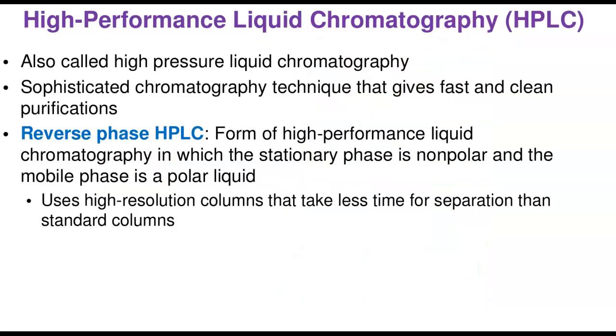So high performance liquid chromatography is also called high pressure liquid chromatography. We have this in our lab. It is the most sophisticated chromatography technique that gives a fast and clean purification.